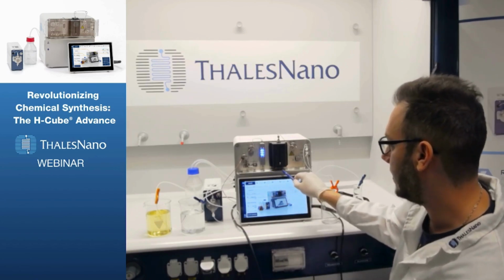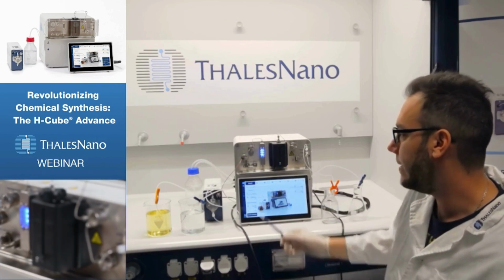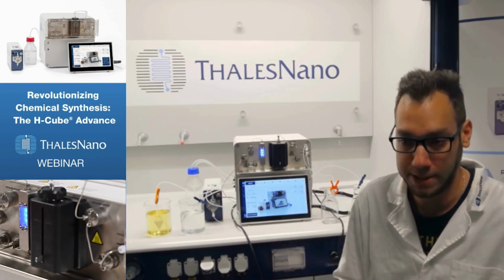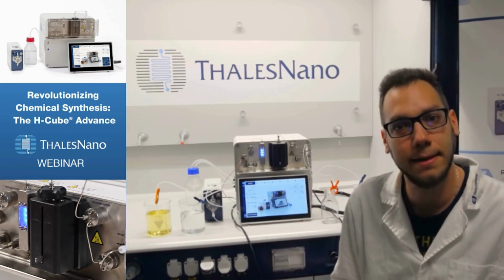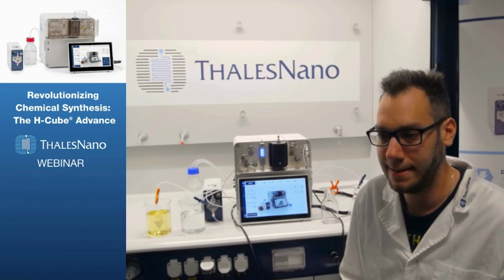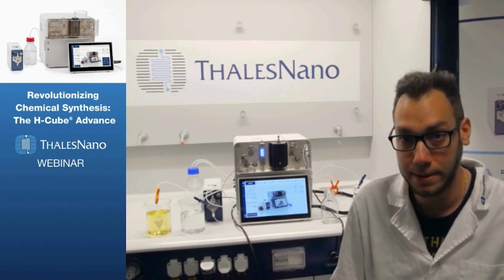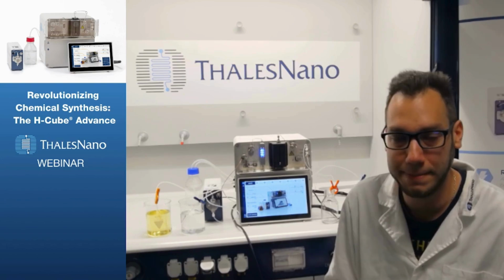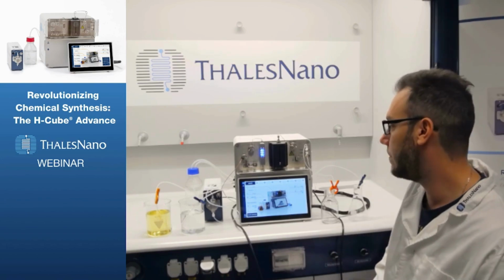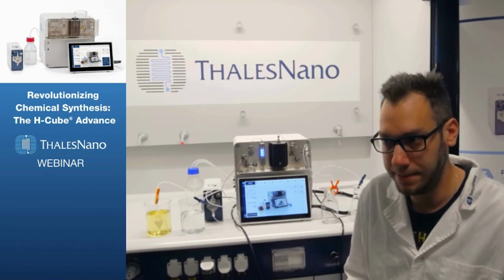And then the next step in the flow path is the actual reactor zone. So this is a heated block, which can actually be cooled down as well. I already mentioned during the first part of the demonstration that it's capable of achieving 0 degrees at minimum and 150 degrees maximum of heating capacity. And this is also the place that holds our catalyst cartridges.